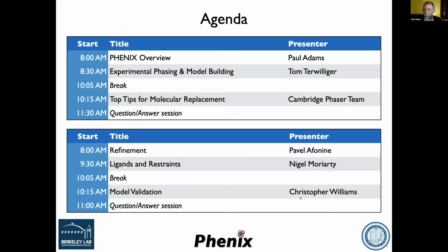Those of you that have Phenix installed should be able to follow along with some of the things in the session. You don't have to, but if you can and you want to, you should. And that might prompt you to ask some questions. Unfortunately, if you're having problems running Phenix because of the way something's set up on your computer, we can't really debug that live right now. But if you do encounter problems, you can send an email to the help address at Phenix and we'll try and sort things out for you later on.